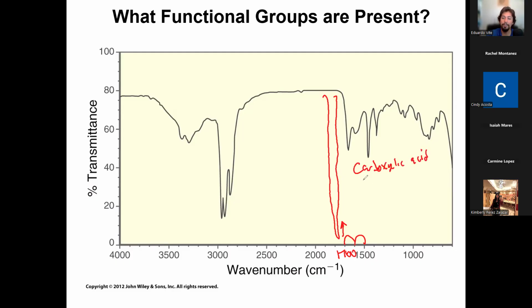You cannot have an ester. You cannot have, what else? An amide. Notice amide, right? You cannot have, what else? Just a ketone, etc., etc., right? So eliminating the carbonyl eliminates half of the list. So there's only a few more options left.